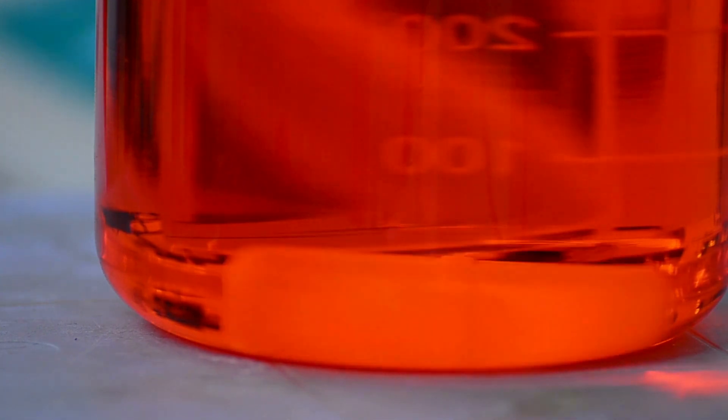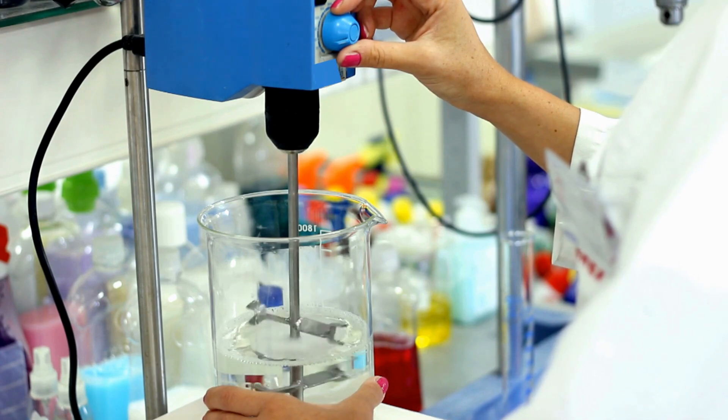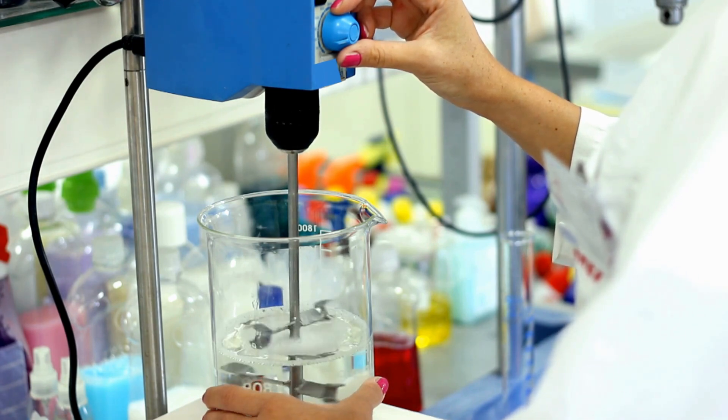Reason one. Precision matters. Ever tried dissolving a tricky chemical? Uneven mixing can ruin your experiment. With a digital stirrer, you get consistent results every time critical for reactions, titrations, or making perfect crystal solutions.